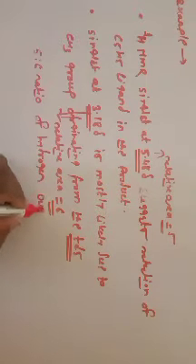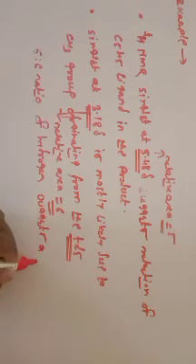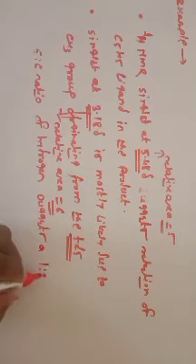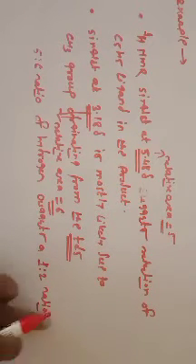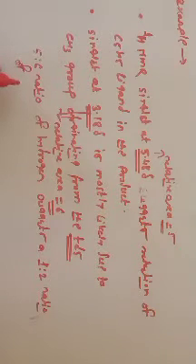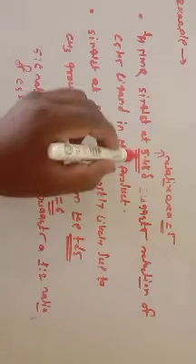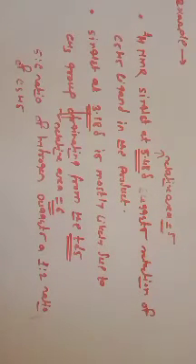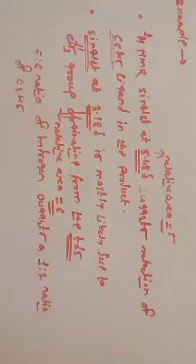which suggests a 1:2 ratio of C5H5 ligands to methyl groups, to CH3 groups. The singlet at 5.48 delta is due to the C5H5, and the other singlet is due to the methyl group from the TDS.